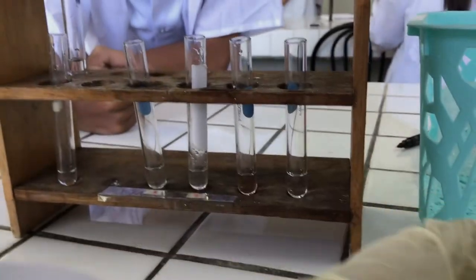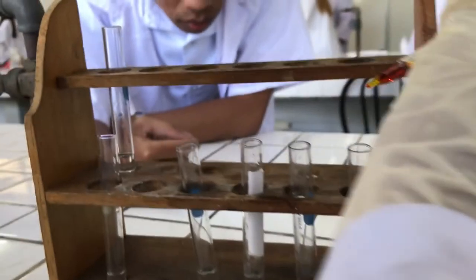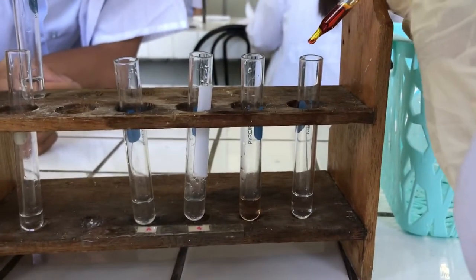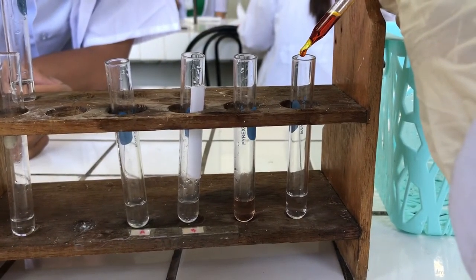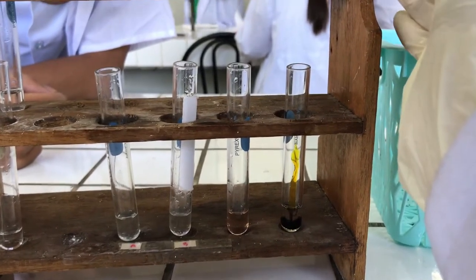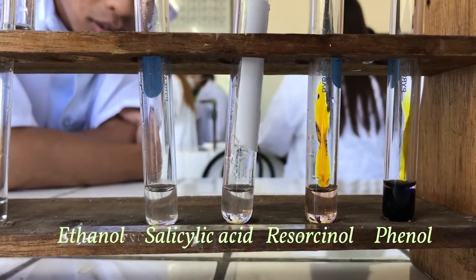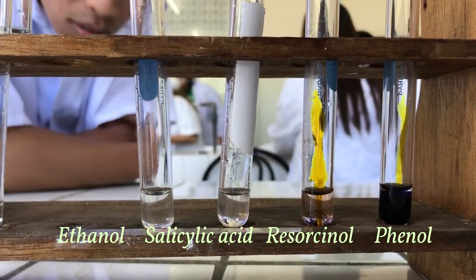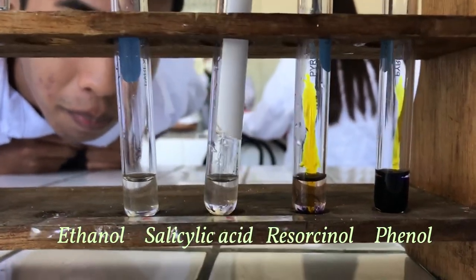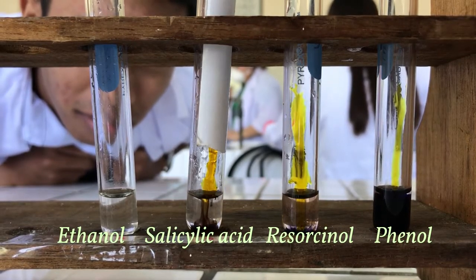Ferric chloride can be used to distinguish most phenols from alcohols. Phenol, with a hydroxyl group attached to an unsaturated carbon atom, mixed with ferric chloride gives a coloration such as pink, violet, or green, whereas ordinary alcohols do not. The color is due to the formation of coordination complexes with the iron.